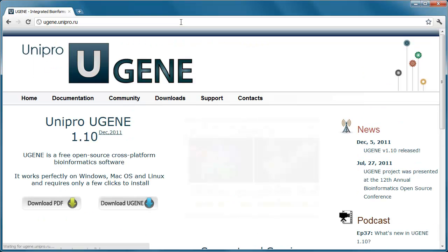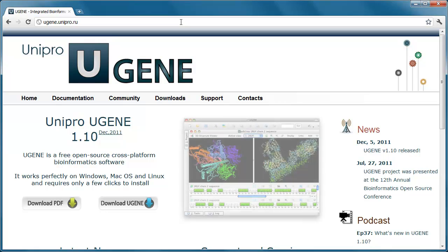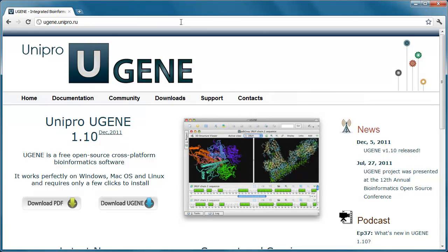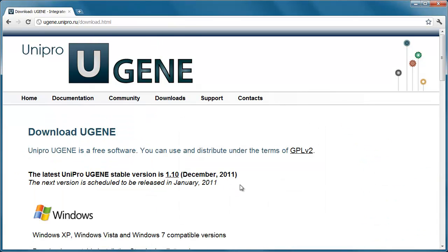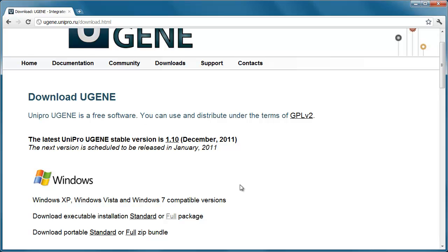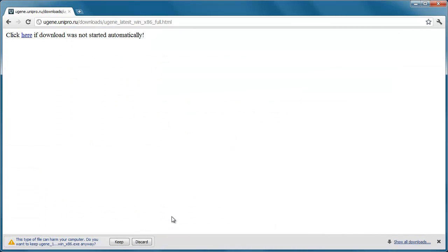This latest version features new embedded tools for short reads aligning and phylogeny. The reading of large sequences and the visualization of assembly data have been improved. I will now talk about the new features in detail.